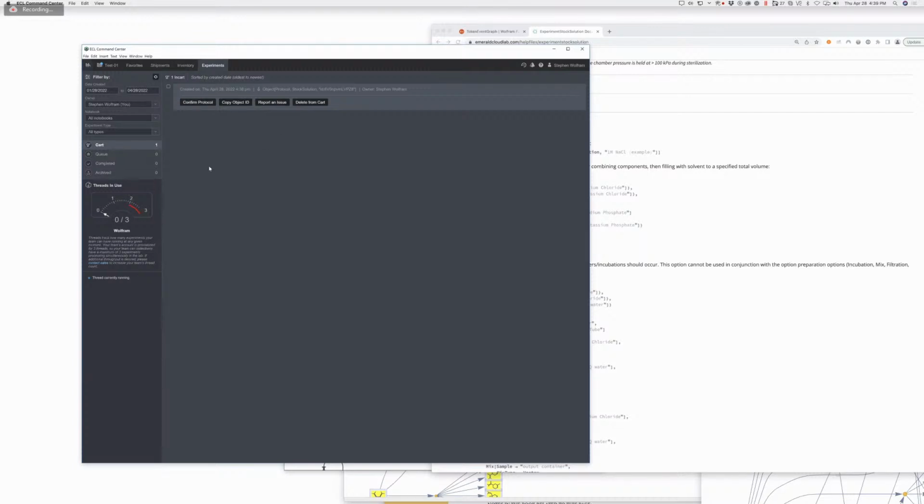I really want to see this. It'll be safe. You'll be okay to make the thing, but that will go make you that stock solution. A liter of it will show up in virtual inventory for you in the lab. But it's not virtual inventory. It's sitting in South San Francisco, an actual liter of water along with all those things as soon as you hit confirm protocol, and that takes about 5 hours to get into the queue. That's what it's doing. It's resource planning to make sure those chemicals and mixtures will be available for you. The people who have to traffic stuff between the machines and clean them afterwards, all that stuff has to be provisioned.